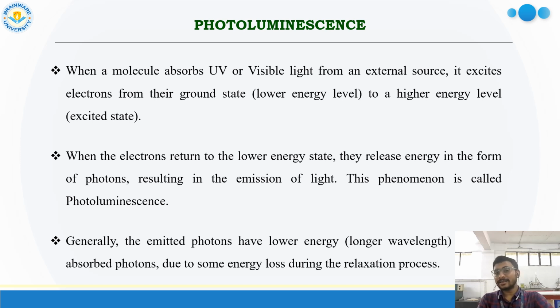They can release the energy in two different forms. They can either release the energy in non-radiative way. Non-radiative way means by transferring the energy to other molecules. Or they can release energy in terms of light. That is the radiative way.